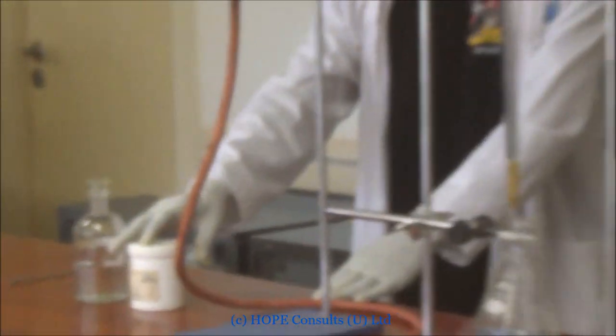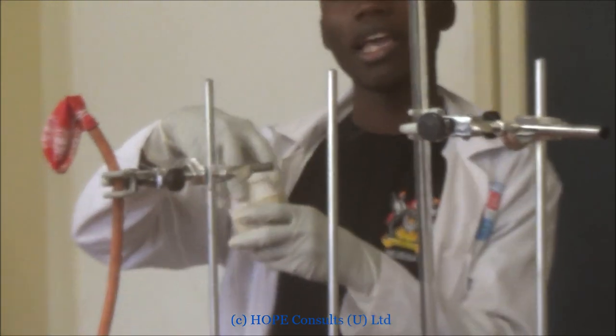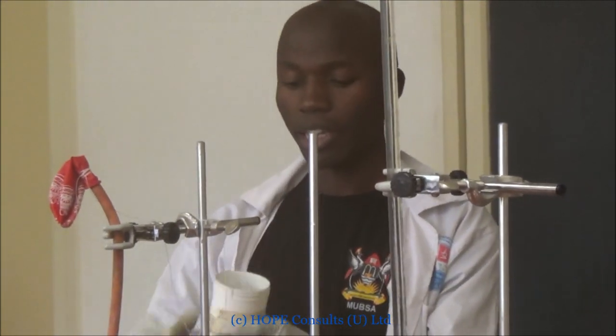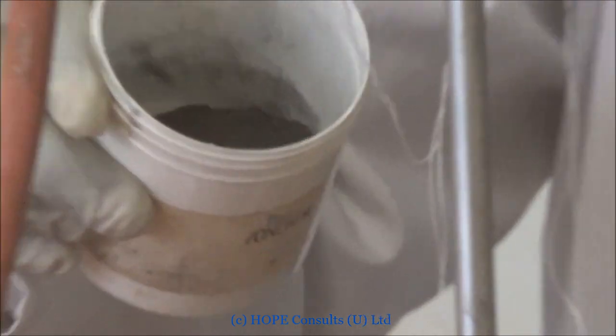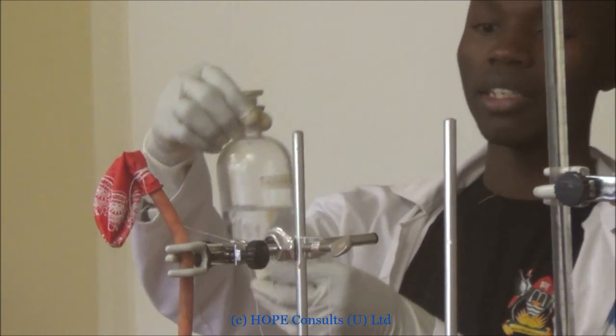First of all, we need iron. It is finely divided to increase the surface area for the reaction. We can also use dilute sulfuric acid. This is 2 molar dilute sulfuric acid.